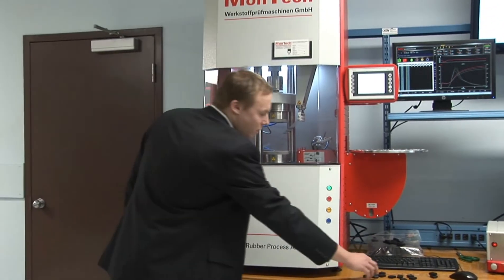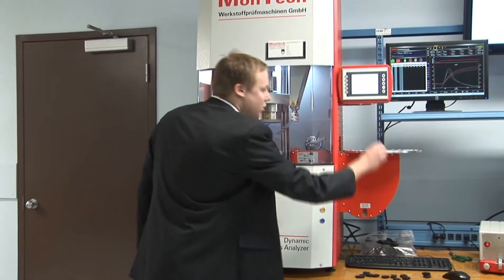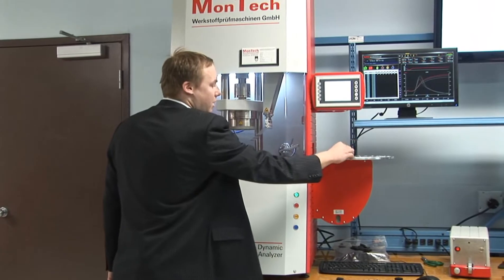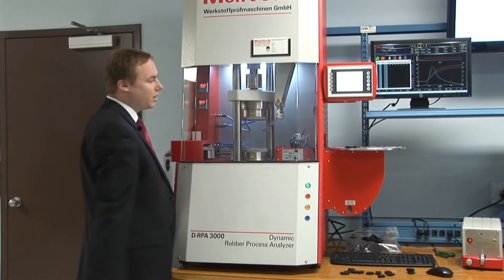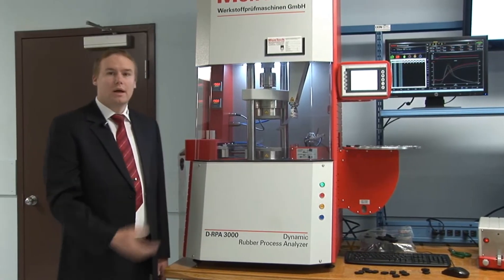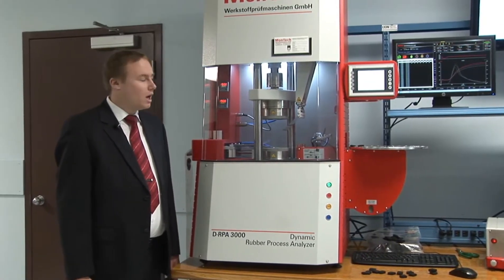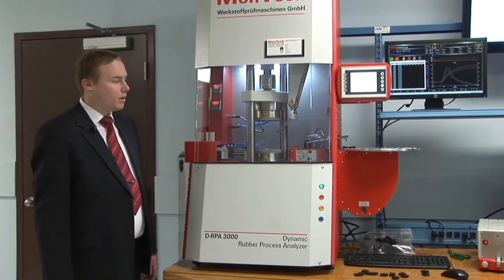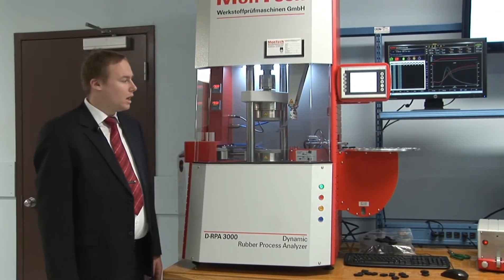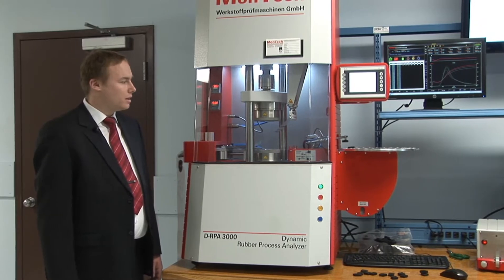Running a test sequence once they are set up in the software is quite easy. You just place the sample on the tray next to the machine, hit the start button, and the machine automatically detects and loads the samples and the film to the dies, then starts to run the test sequence.